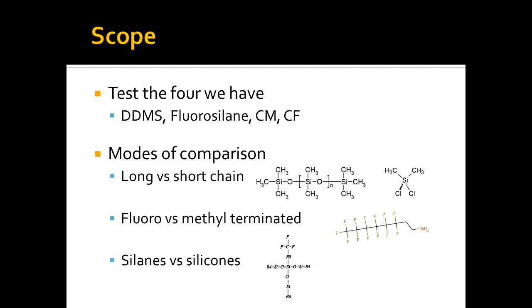While there are numerous other coatings, all kinds of specifically tailored silanes and silicones, we will only be testing the 4 that we have, but among these, I feel there are a few different modes of comparison. These kind of represent different types in a way.